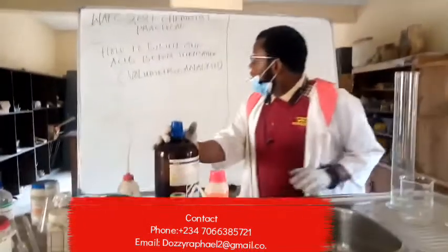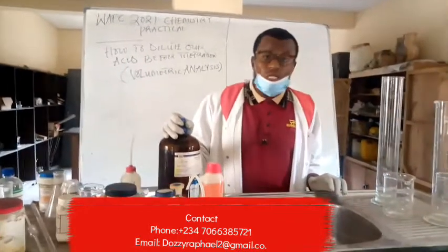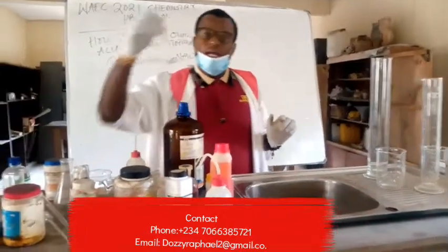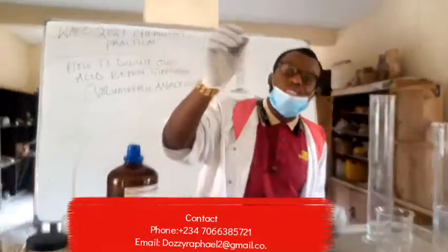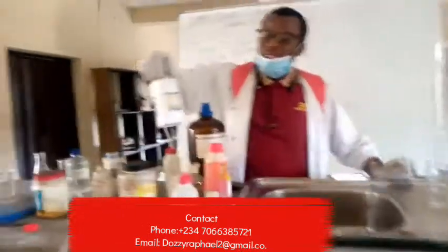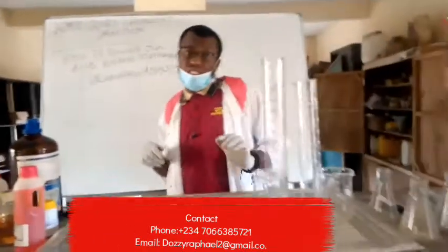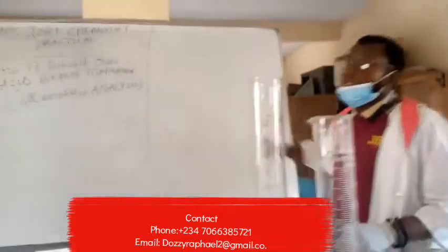Today we'll be looking at how to dilute our acid. This is our concentrated HCl — highly concentrated. This is my plastic water, and this is my measuring cylinder, calibrated from 2 to 10 ml. This is my copper sulfate — that is for the salt, that is for C. We're looking at A, B, and C.